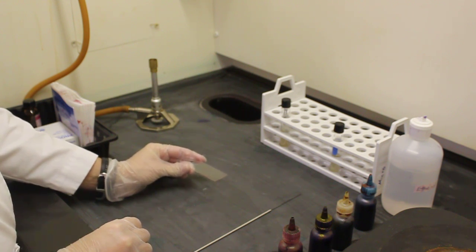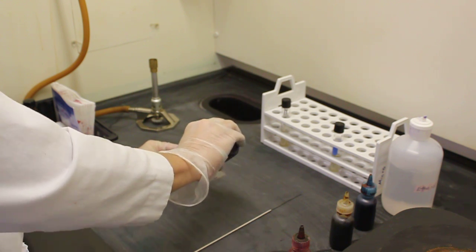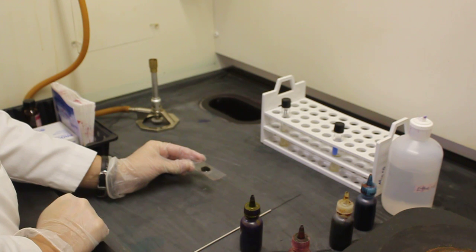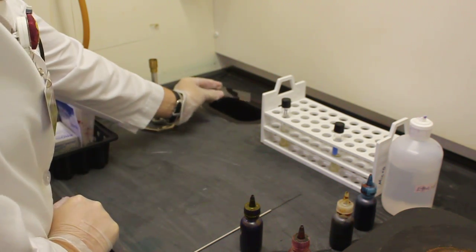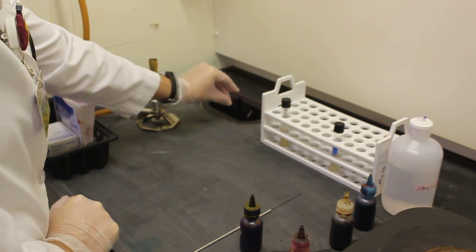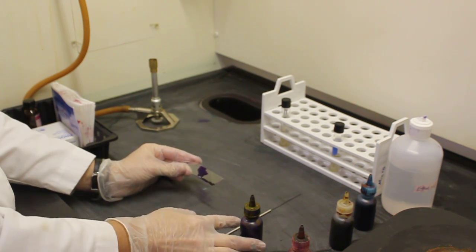To complete my gram stain I will apply my primary stain crystal violet to the area of the smear. I must allow this color to sit on the slide for one minute. Once one minute has passed I will shake the excess crystal violet off of my slide. At this point all cells on my slide would be purple from the crystal violet.